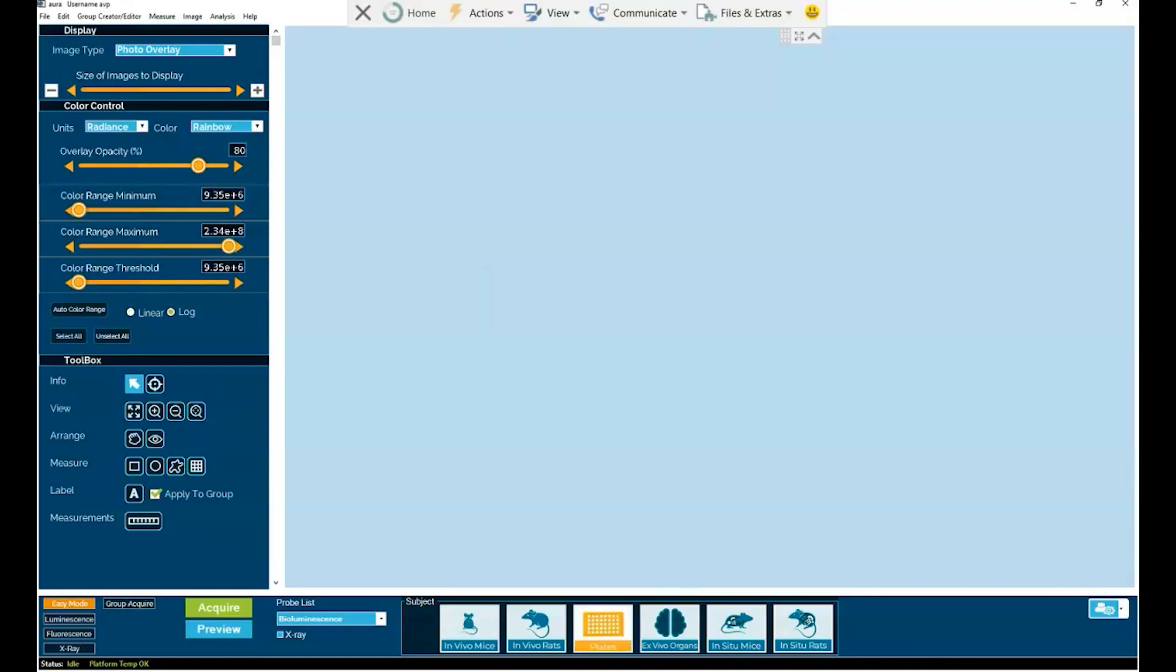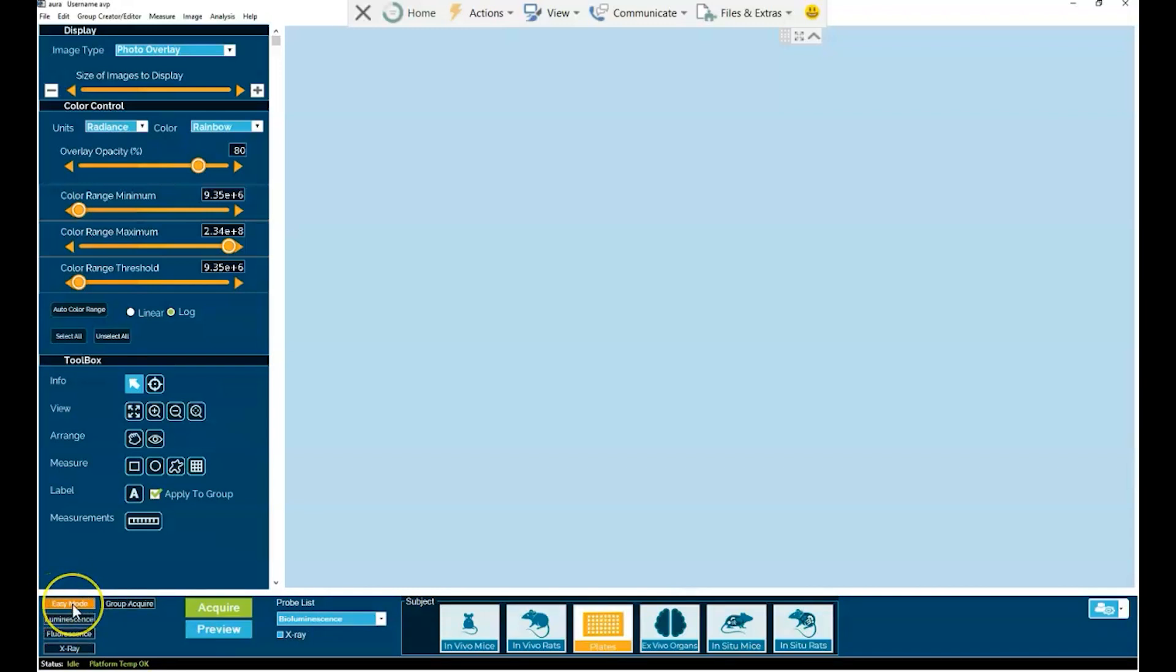Now first off, there is easy mode. This makes imaging faster and easier than ever before. Selecting in the bottom left-hand corner the easy mode option, you will see for the acquisition ribbon that it is simply a matter of selecting three buttons.